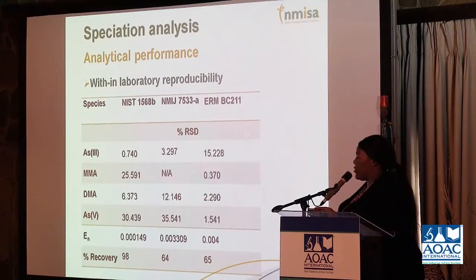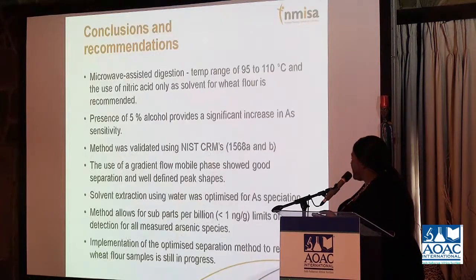We did a within-laboratory reproducibility as well, and also got these RSDs, with arsenic 5 and MMA having high RSDs for the NIST rice flour.